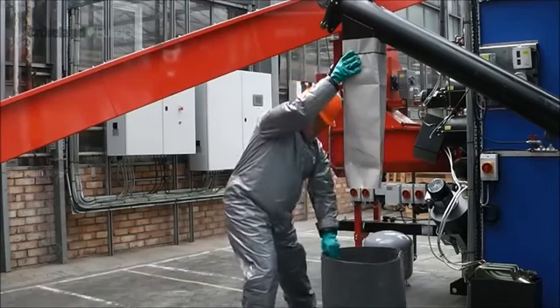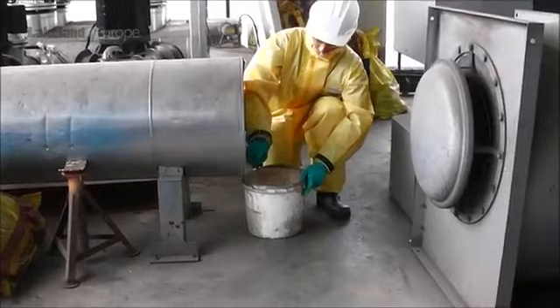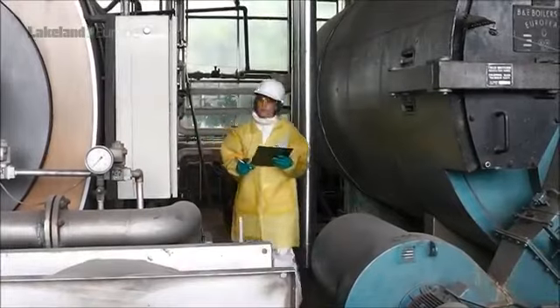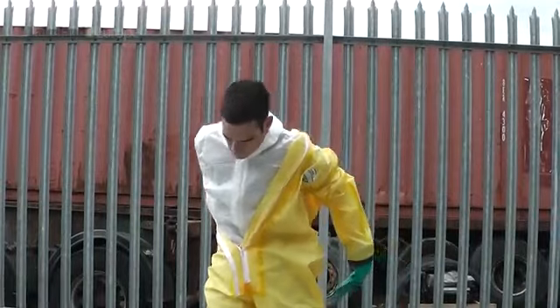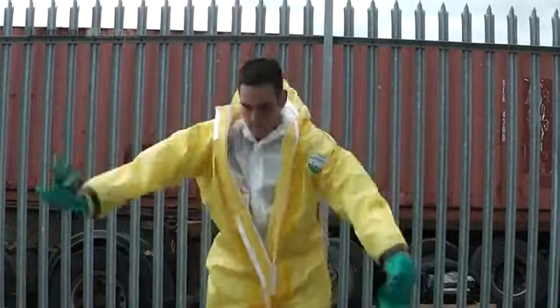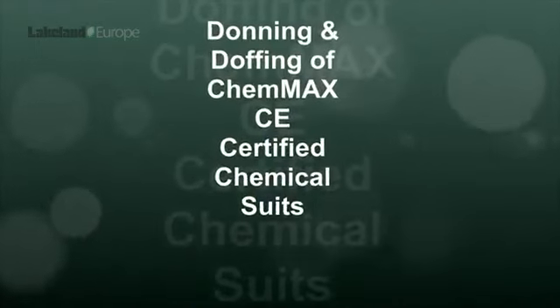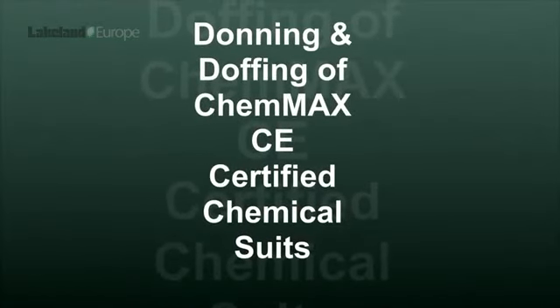However, the process of donning and doffing a coverall is at least as important as the design and quality of the coverall itself. An incorrectly worn or damaged coverall might not protect the wearer as it should, and the process of removing it after use is vital and often subject to the highest risk of contamination and potential injury. The following instructions provide users with a guide to appropriate donning and doffing of Lakeland Chemmax chemical protective coveralls.